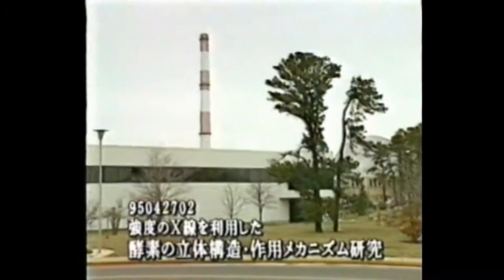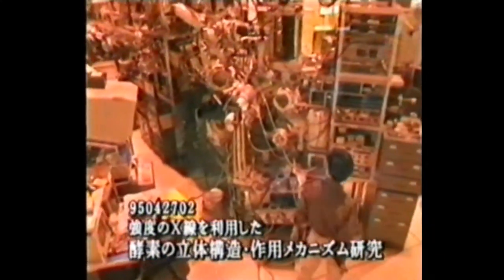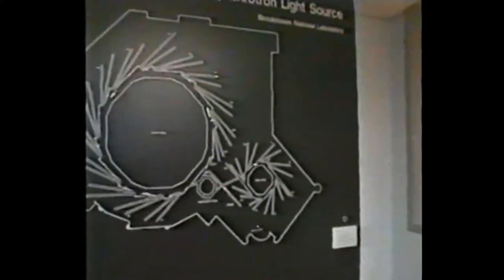One of the most important biological research tools at Brookhaven is the National Synchrotron Light Source. Constructed in 1982, this second-generation synchrotron is one of the best sources of intense X-ray radiation in the world. In this synchrotron, electron bunches are accelerated to an energy of 750 million electron volts. The bunches are shunted through magnets and used to fill the ultraviolet and X-ray storage rings. Each ring has photon shutters which allow UV or X-ray radiation to be directed to research stations.